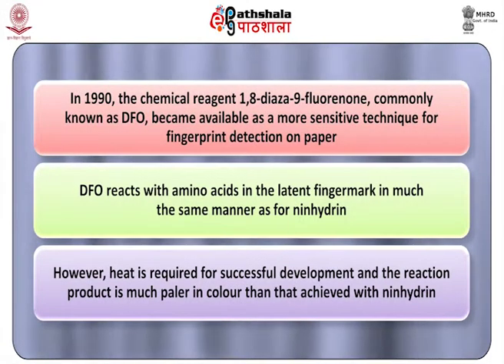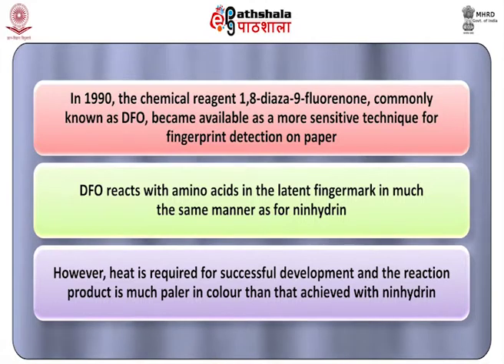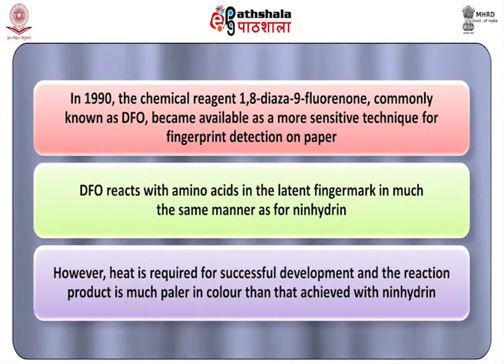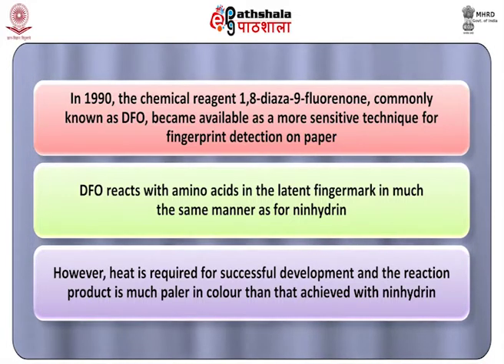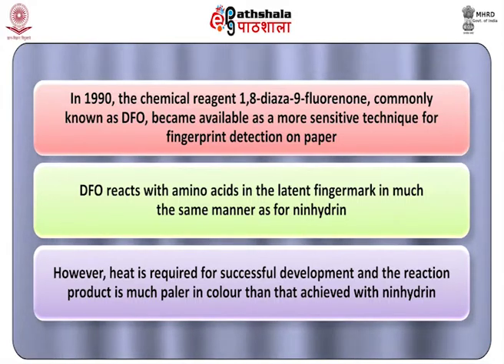In 1990, the chemical reagent 1,8-diaza-9-fluorenone, commonly known as DFO, became available as a more sensitive technique for fingerprint detection on paper. DFO reacts with amino acids in the latent finger mark in much the same manner as ninhydrin.